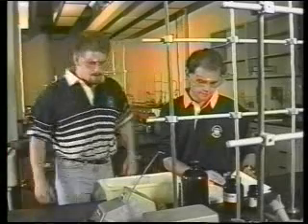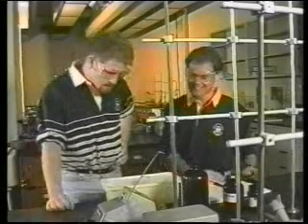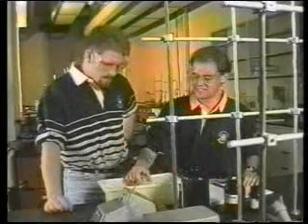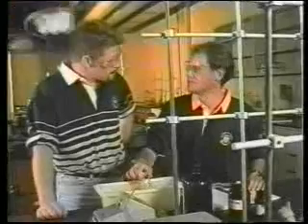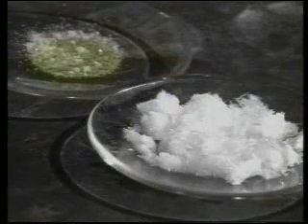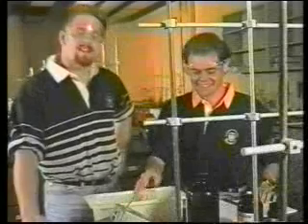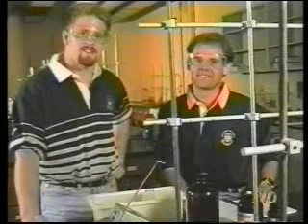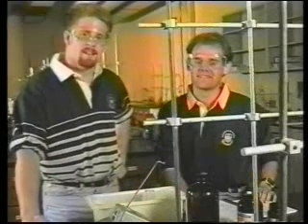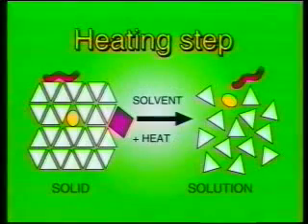Wow! Nice crystals. Thanks. I'm recrystallizing a bunch from my lab this afternoon. It really feels good to turn a mess into something beautiful like this. Recrystallization is a basic purification technique. Let's watch how the stagehands do it.